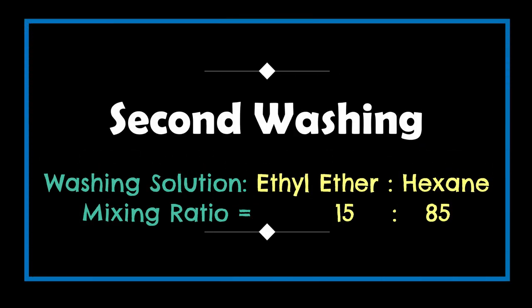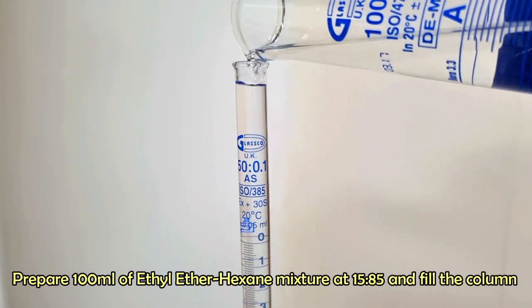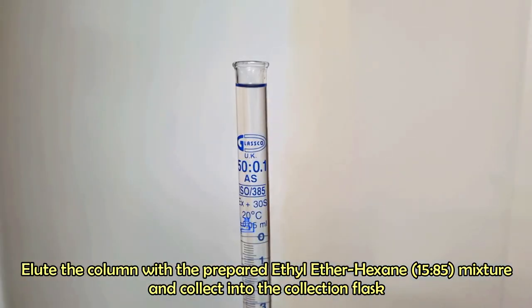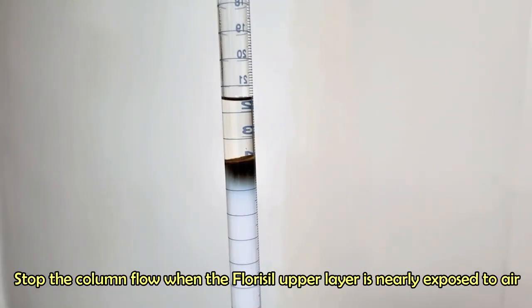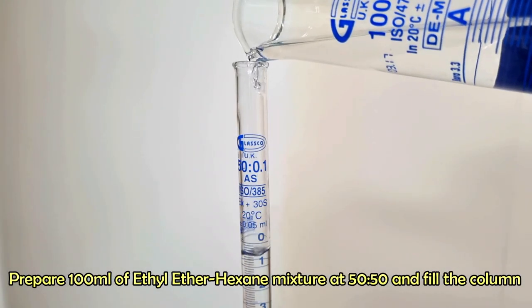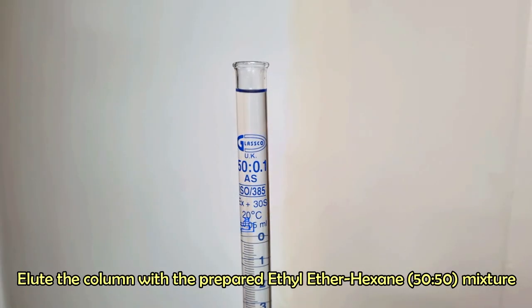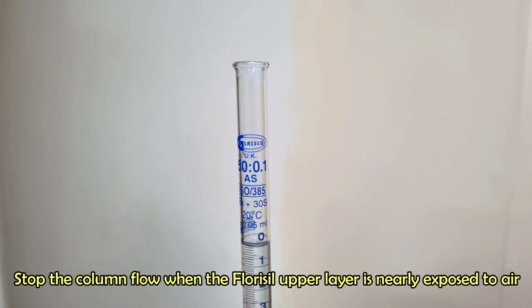Prepare 100 ml of ethyl ether and hexane, 15:85 mixture. Elute the column with this ether to hexane mixture and collect into the collection flask. Stop the column flow when the florisil upper layer is nearly exposed to air. In the same way, perform a third elution using 100 ml of diethyl ether and hexane, 50:50 mixture. Stop the column flow when the florisil upper layer is nearly exposed to air.